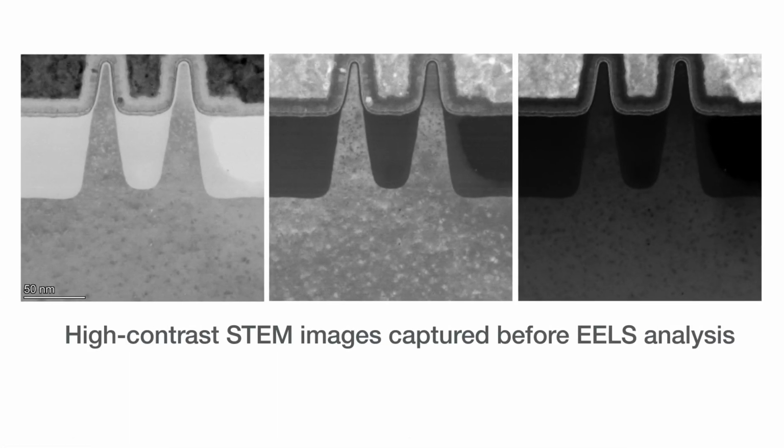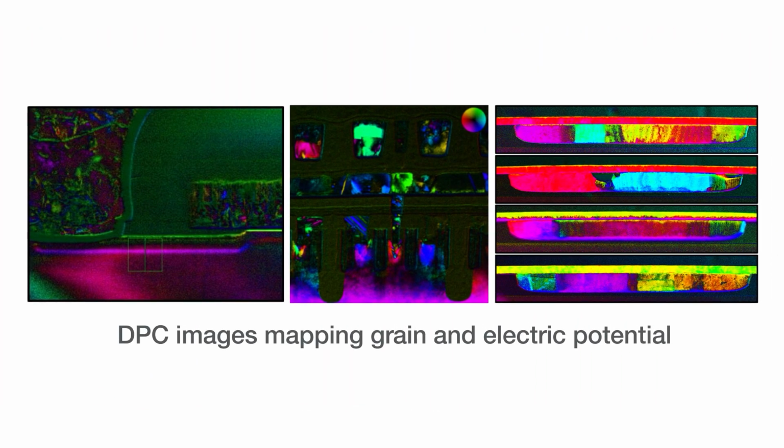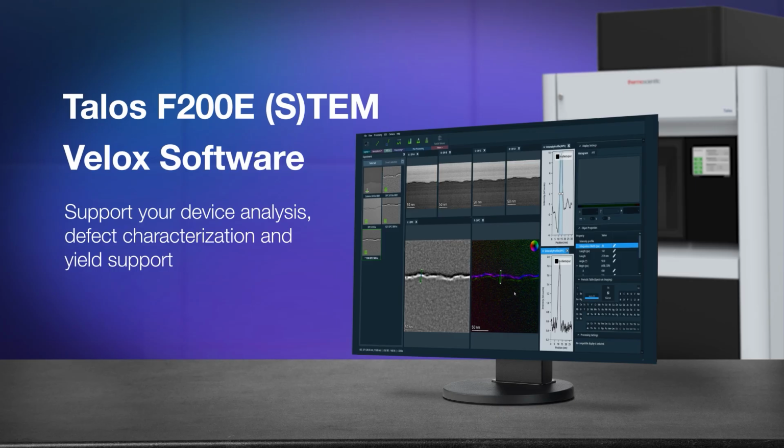As you can see, a variety of elemental analysis techniques are accessible and efficient with the Talos F200E STEM. Learn how the Talos F200E STEM with Velox software can support your advanced device analysis.